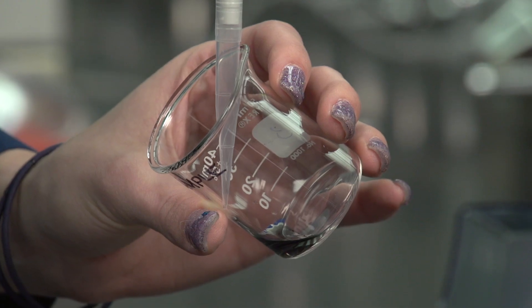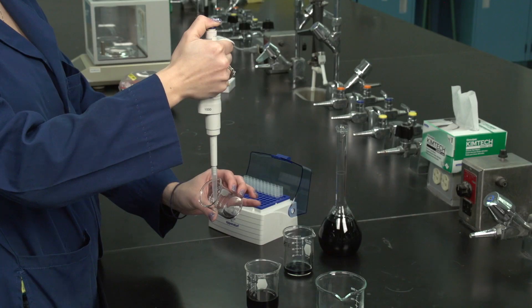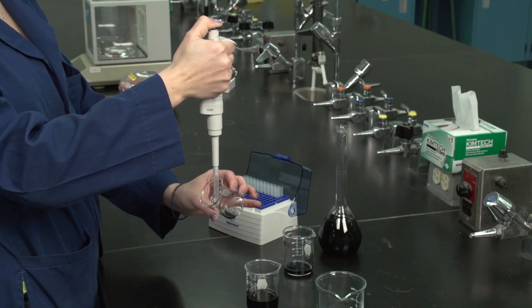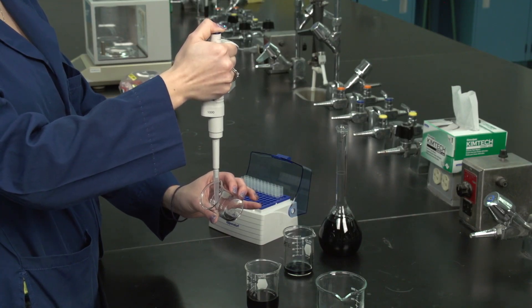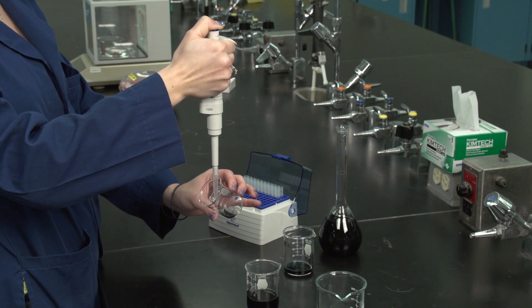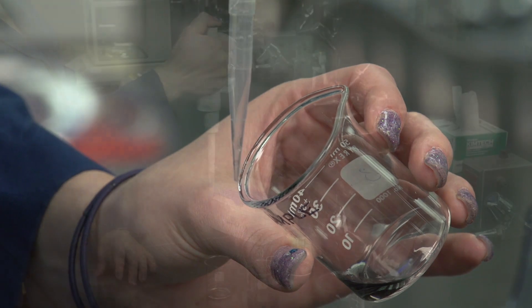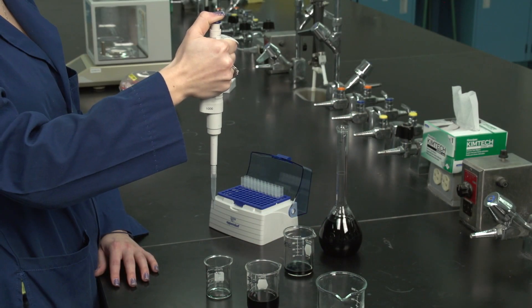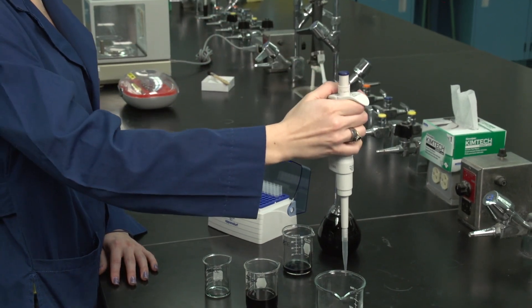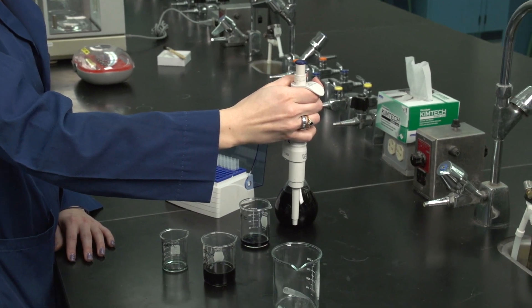Wait until the liquid stops flowing. Press down on the plunger to the second stop until the tip is completely empty. Hold down the plunger and guide the tip up the inner wall of the receiving vessel. Allow the plunger to slide up slowly. Eject the tip by pressing the ejection button on the side of the pipette.